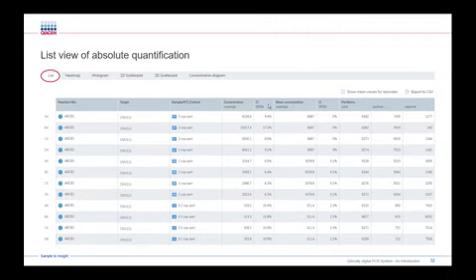The confidence interval shows the value of the confidence interval at a 95% confidence level. If replicates have been used, and replicates are defined by using the identical reaction mix plus the identical samples, then you also could see the mean value of those replicates. Last but not least, the partitions. This column shows the number of valid, positive, and negative partitions per well and target or channel.